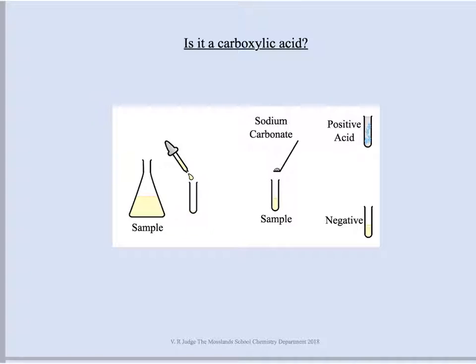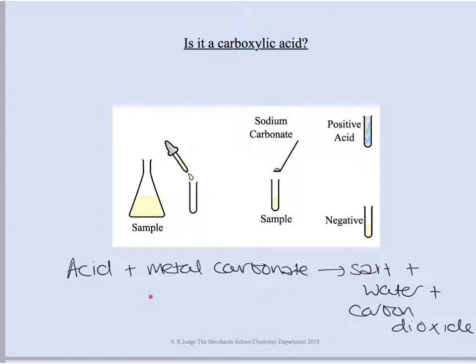So if it's an acid, sodium carbonate would react with it and the reaction would fizz. You'd see bubbles, and if you add the sodium carbonate and there's no reaction, you don't see any change. So you should be familiar with this reaction along the bottom. So your reactions of acids, acid plus metal carbonate, such as sodium carbonate, will give you a salt plus water, which will give you a salt solution in here, and carbon dioxide, which is obviously a gas, which provides the bubbles and the fizzing. So to double check that, you could, if you wanted to, collect the gas that comes out of here and run it through some lime water, and you would see that the lime water goes cloudy.